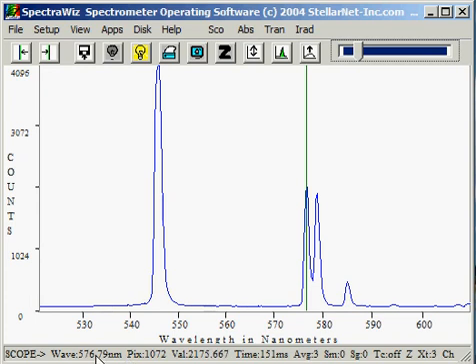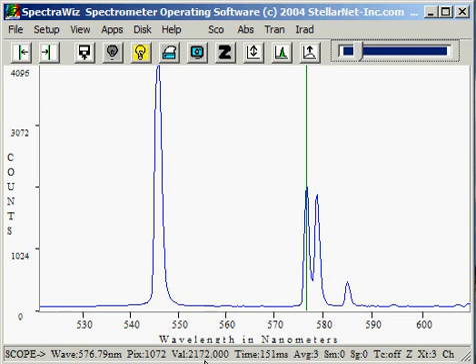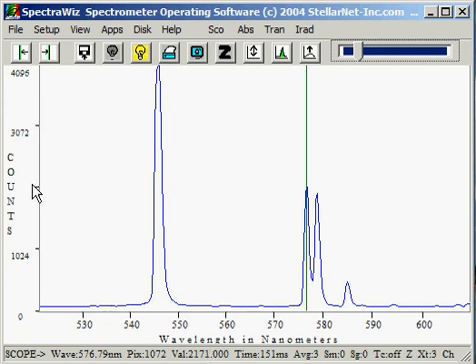Wave is the wavelength on the x-axis where the green data cursor is currently located. Pix is the pixel number in the linear detector array. Val is the magnitude on the y-axis. In scope mode, the magnitude is counts.